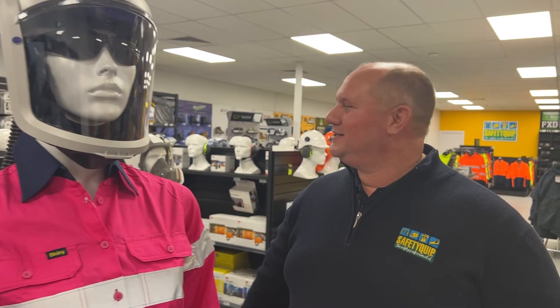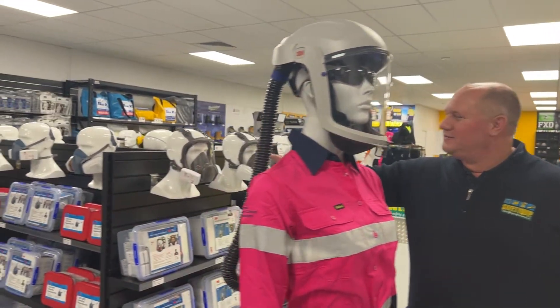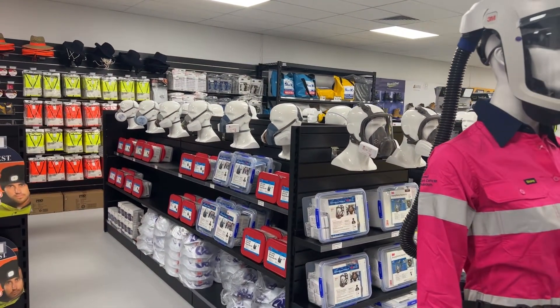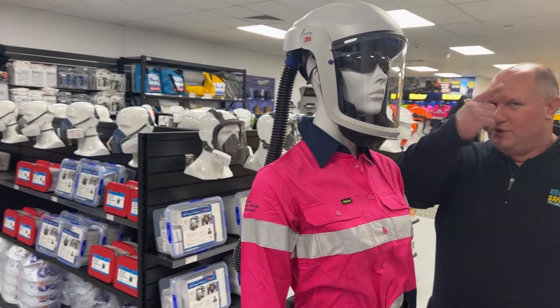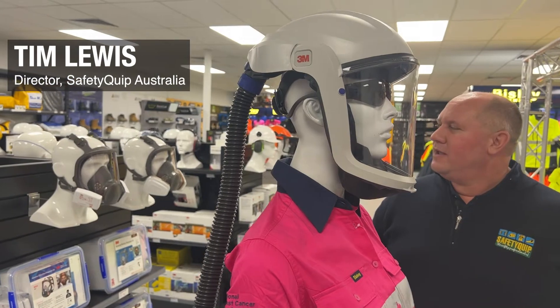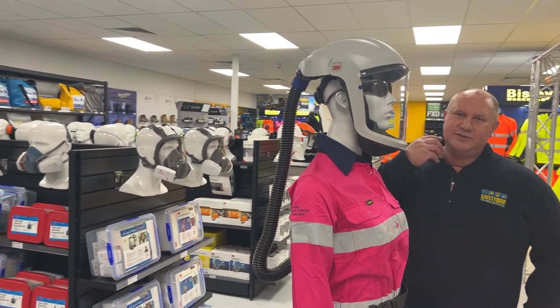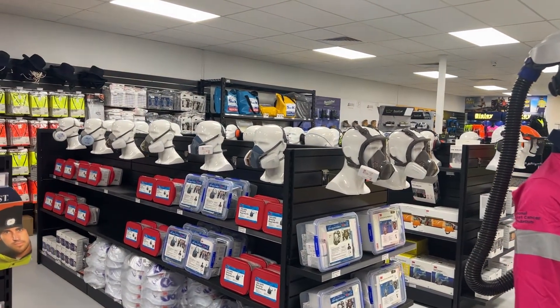Now traditional respirators — all of the ones over here — these are half face respirators and full face respirators. They're what we call negative pressure respirators, so they're reliant on the person breathing in air through a filter, and they're reliant on an effective facial seal around the edge of the respirator. That isn't suitable if you've got any length of facial hair; you simply don't pass a fit test with traditional negative pressure respirators.